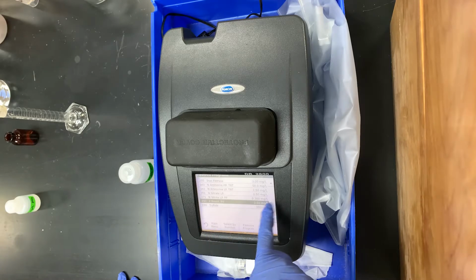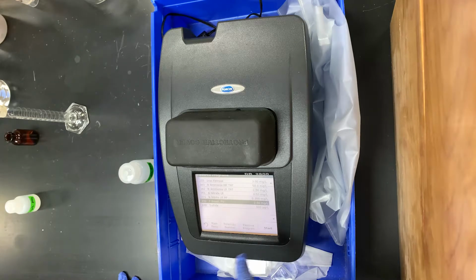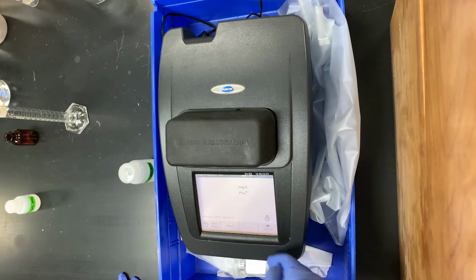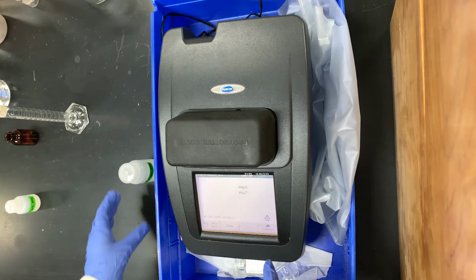So if we just go into favorite programs here, there is one for reactive phosphate, and it does say 2.5 milligrams per liter on the side. So that just means that is the upper range for this method, and the actual range is about 0.02 to 2.5 milligrams per liter as phosphate.